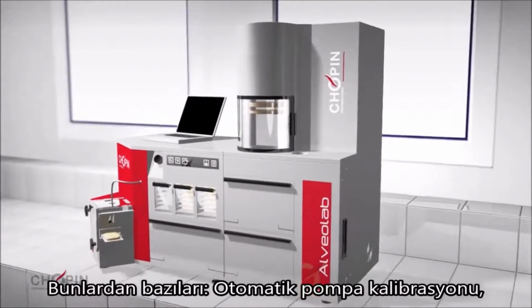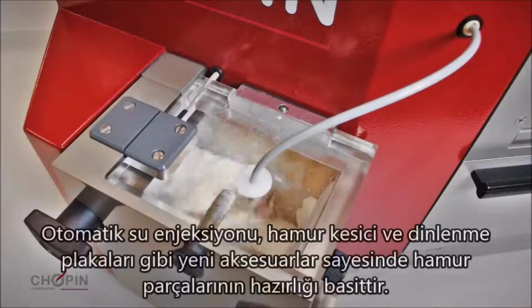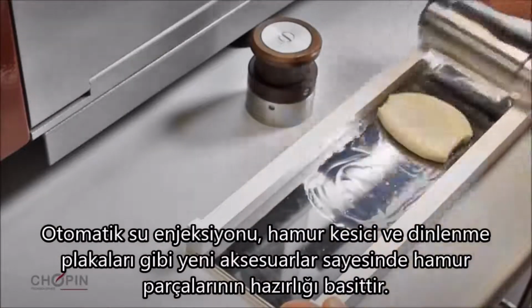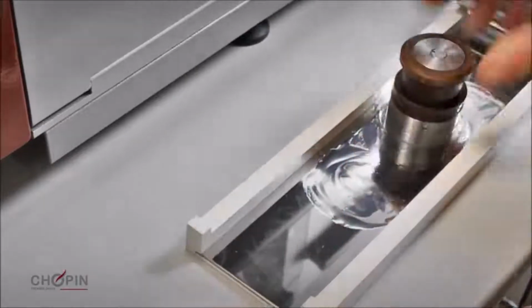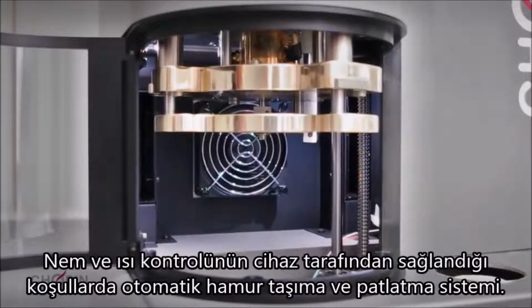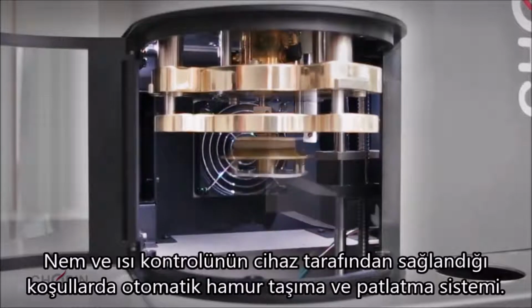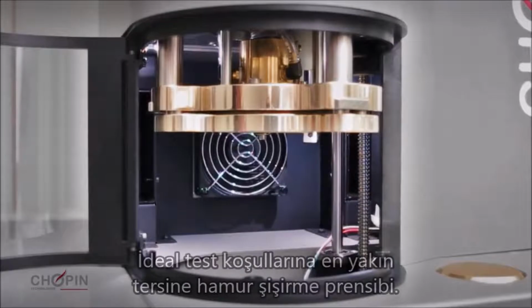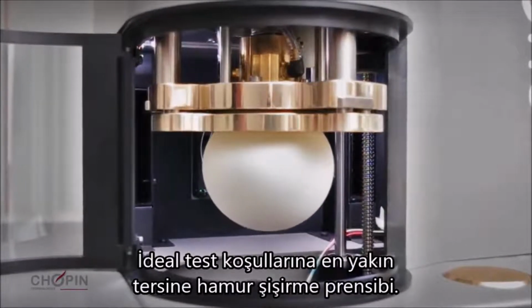Some examples of these innovations are automatic pump calibration, automatic water injection, new accessories such as resting plates and a dough cutter to better control the preparation of dough pieces, automatic positioning and swelling of dough pieces in a humidity and temperature-controlled compartment, the inverted bubble, which is more spherical and closer to the ideal test conditions.